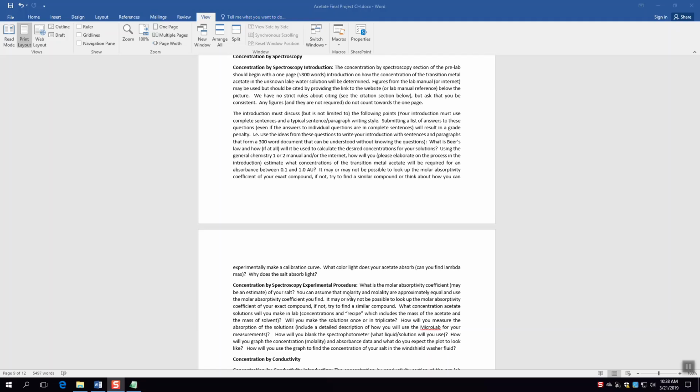So what I'm going to do is give you some exact numbers that you should work with in this experiment. Now, it's important to note that because we're eventually going to be using these values in order to determine an experimental van 't Hoff factor, we need to actually work in molality and not molarity. So for the sake of making our solutions, we're going to be doing them as moles per kilogram of solvent rather than liters of solution.